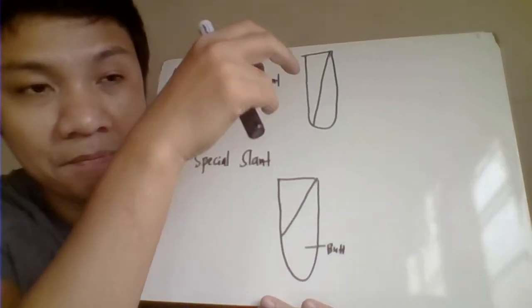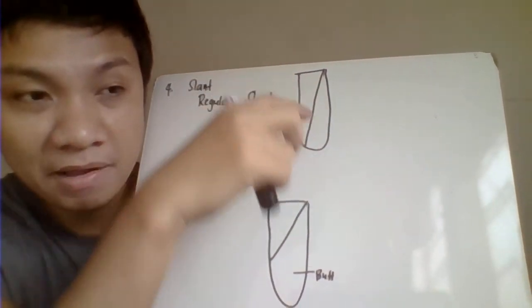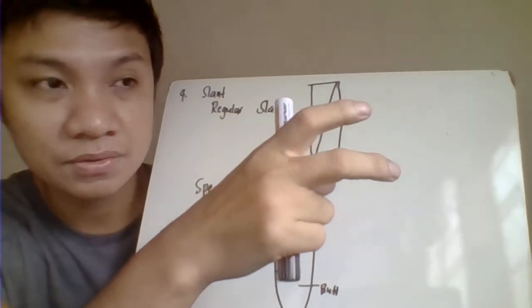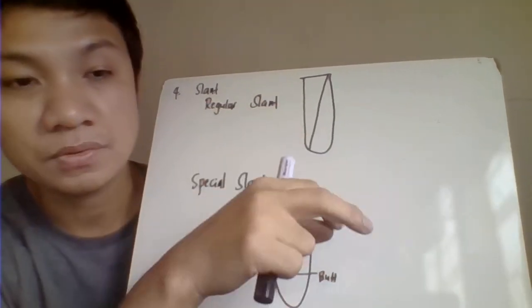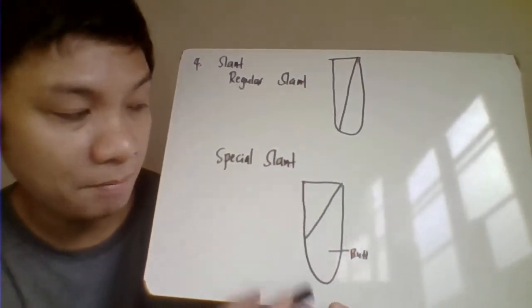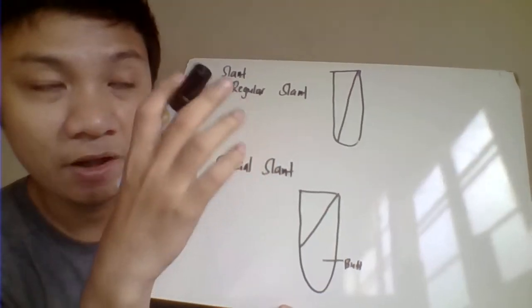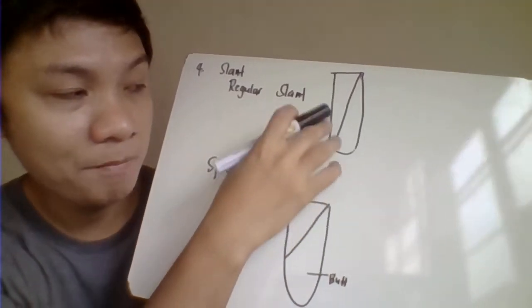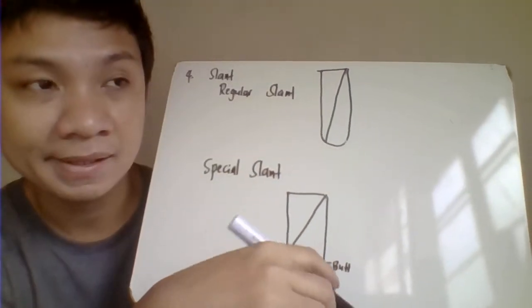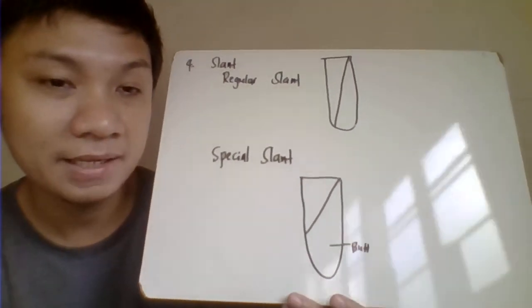Wait lang. Open mo ang screw cap container. Bago ka kumuha, i-flame mo ang mouth. Kukuha ka ng bacteria inoculum. Before mo siya i-close, i-flame mo muna bago siya i-close. Same with your culture media or mga plates. Pag nag-open ka ng plate, bago ka mag-inoculate, open the plate, flame. Then inoculate. Then before you close, flame. Ganun palagi ang technique natin.